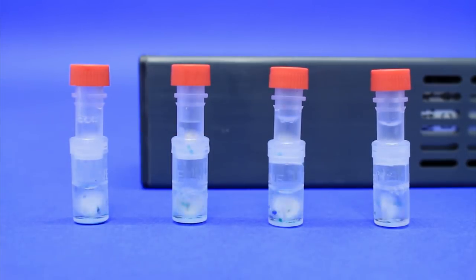The stir disc can aid in the dissolution of powders and can help to keep viscous samples mixing during long incubation periods.